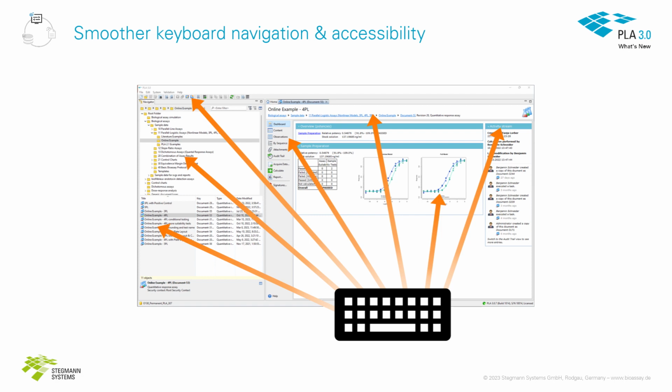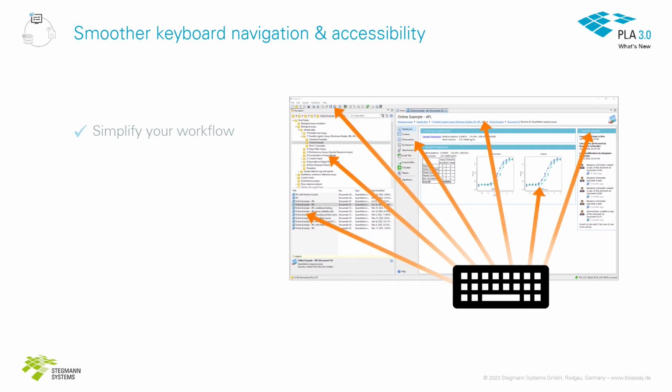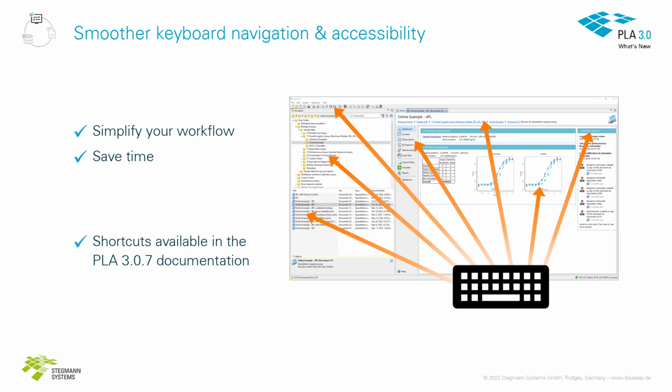We refine the keyboard navigation through the software to conveniently access all parts of the UI. Simplify your workflow and save time by using shortcuts. Make sure to check our PLA 3.0.7 documentation for a full list of shortcuts.